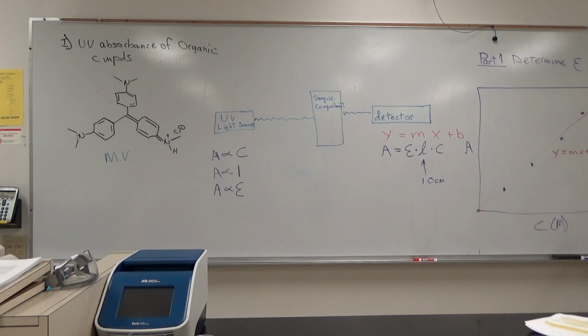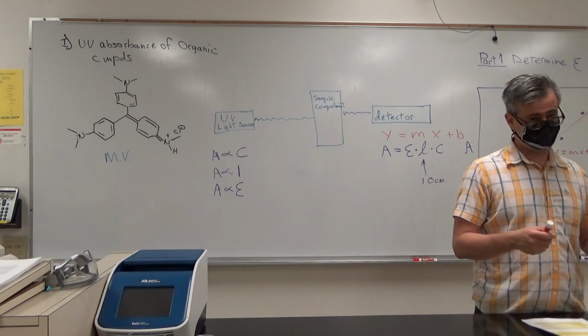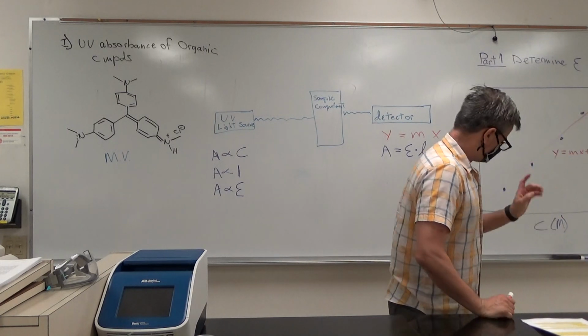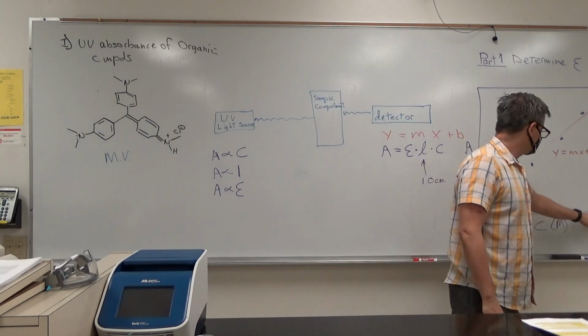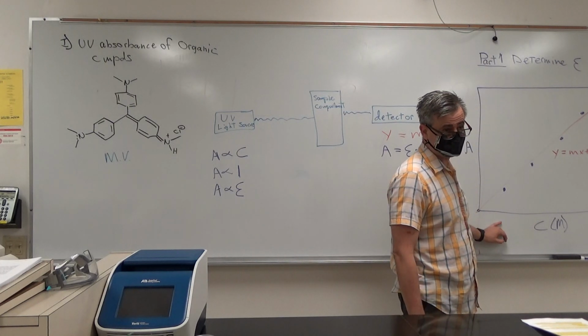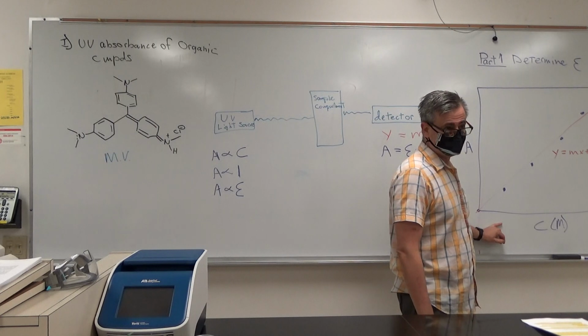In my experience, what that mistake typically is, because the concentrations back there are in scientific notation, 3.4 times 10 to the negative 5, 5.6 times 10 to the negative 6, is there's been a problem putting it in your Excel spreadsheet and obeying scientific notation.